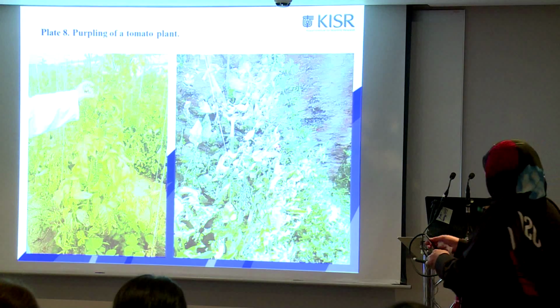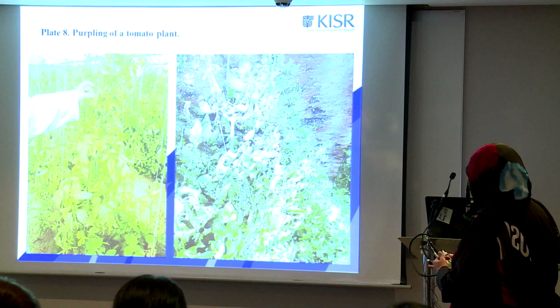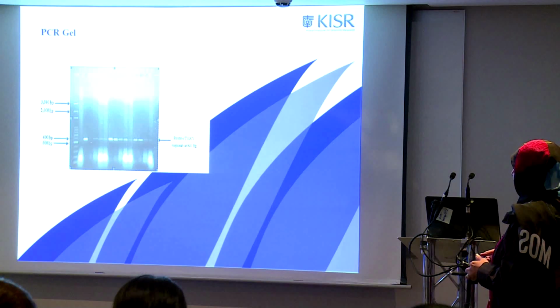You can see the problem. It's spread and destroyed all over the plants. Here's the gel, which shows the positive gene.